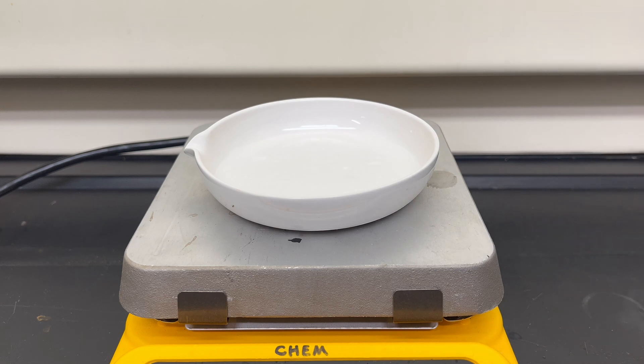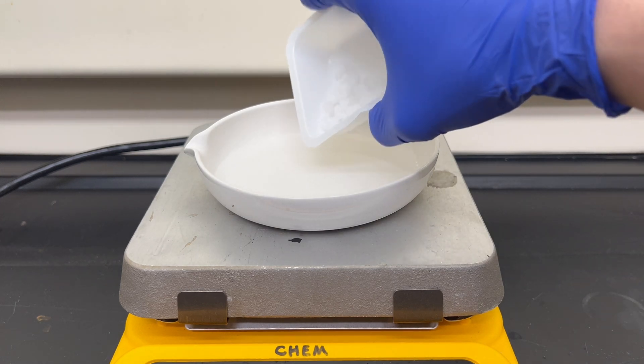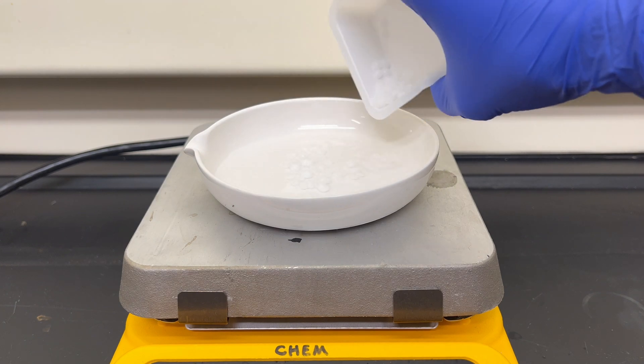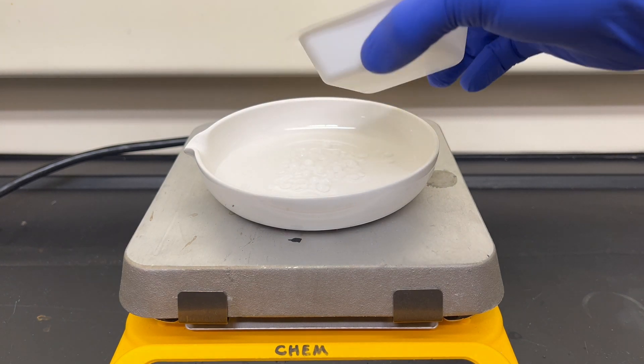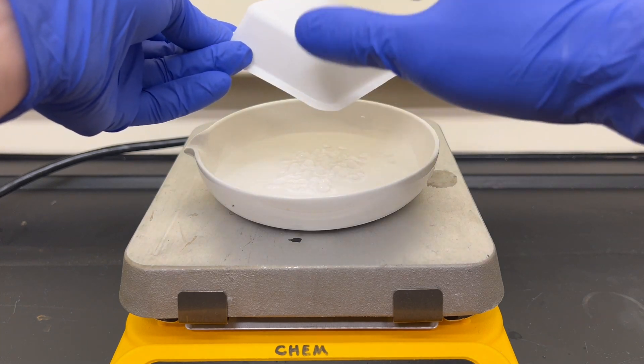I place 10 grams of sodium hydroxide and 25 milliliters of water into an evaporating dish, using a hot plate as a heat source. The sodium hydroxide is stirred in until wholly dissolved.